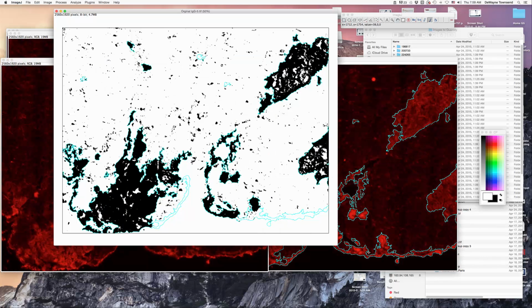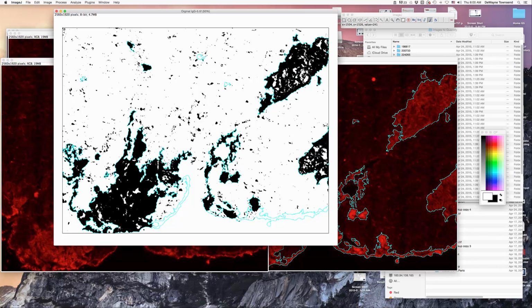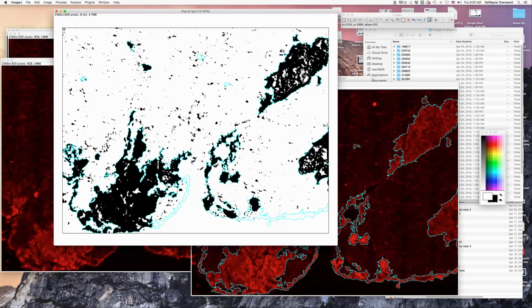So I'm basically using this image as a guide. I'm going to say anything to the right of this little hole is not worth including. Alright, so we'll sketch that away. And then we have this random area up over here. I'm going to say it's something like that. And again, we'll assess this in just a moment. Alright, so then this area along the edge here up to here is probably not worth keeping. There's maybe a little myocyte here, this guy. So it's a little trickier to see, to move some of these images around to be able to appreciate that.